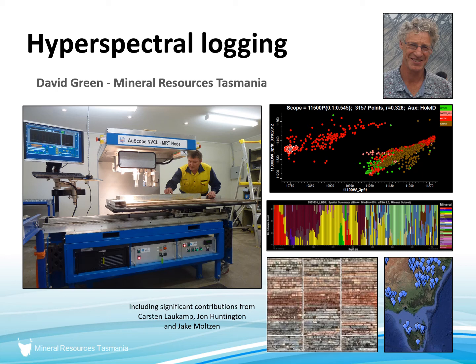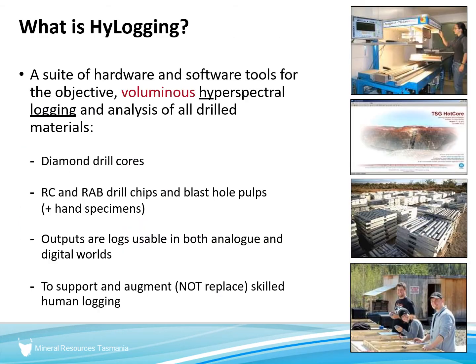Hello, I'm David Green. I'm a geologist with Mineral Resources Tasmania, a spectral geologist mainly, and I'm going to take you through hyperspectral logging, use of infrared spectroscopy to identify minerals in mainly drill core, and how that can be used for a range of purposes, many of which can be applied to geometallurgy. Okay, on with the show.